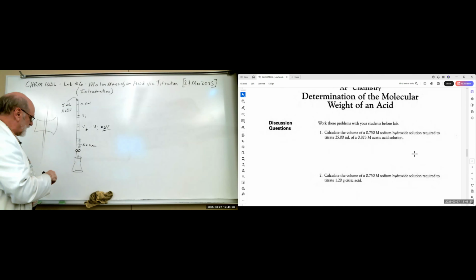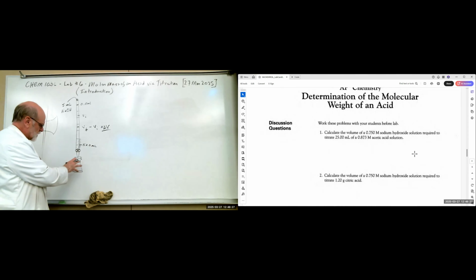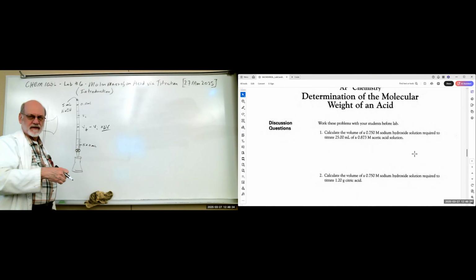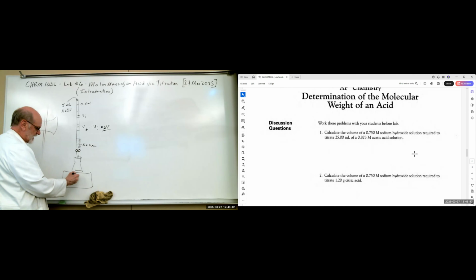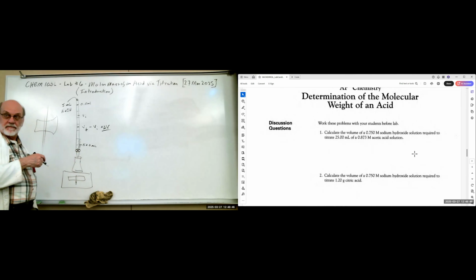And then we're gonna, for convenience, now the method might say you're gonna use an Erlenmeyer flask and you're gonna add some of this material, and then you're gonna swirl it. And then you have to put it back down under there and do it again. We're gonna make it quicker. We've got magnetic stirrers, right? There's a magnet in here, a big magnet that spins.